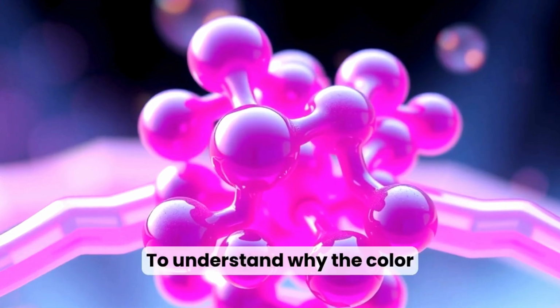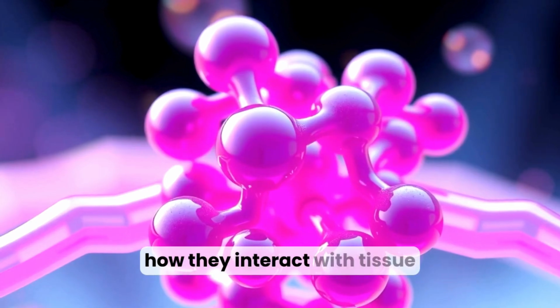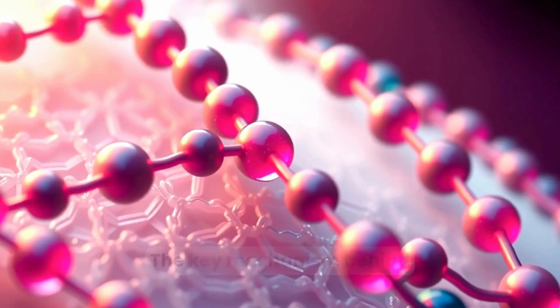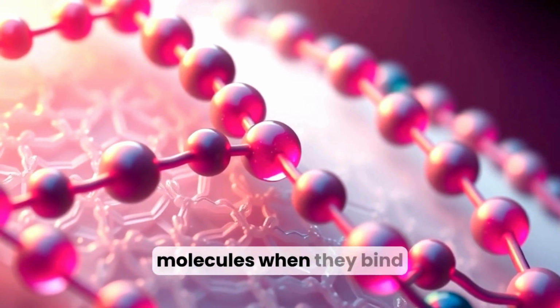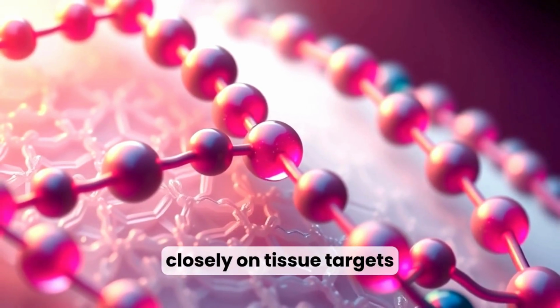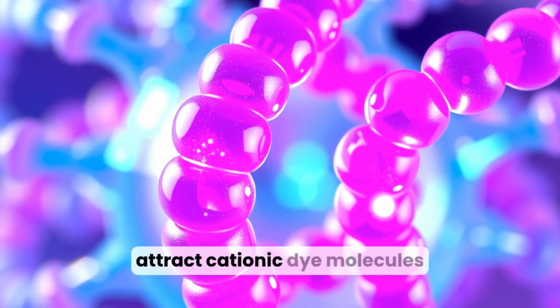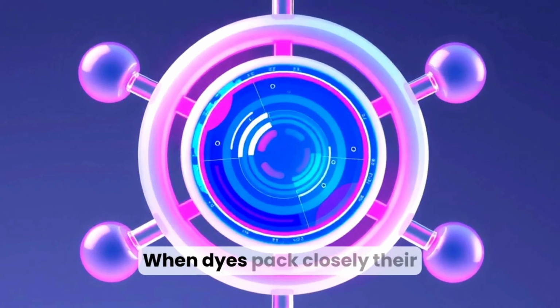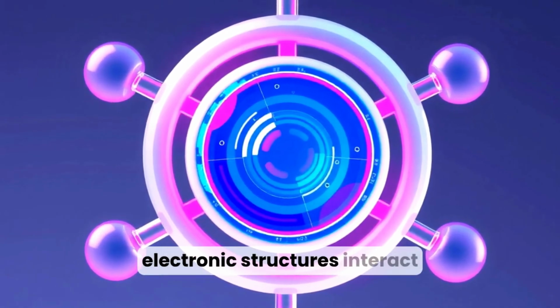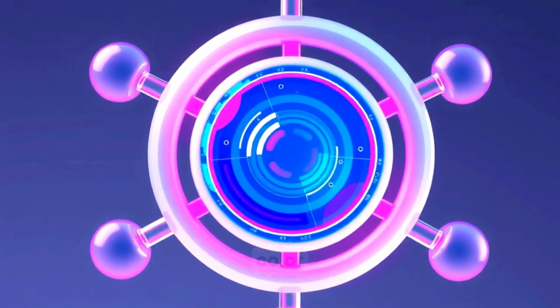To understand why the color changes, we need to look closely at dye molecules and how they interact with tissue components. The key mechanism behind metachromasia is polymerization of dye molecules when they bind closely on tissue targets. Many target tissues carry strongly negative charges that attract cationic dye molecules and encourage tight packing. When dyes pack closely, their electronic structures interact and absorb light differently, producing a shifted visible color.